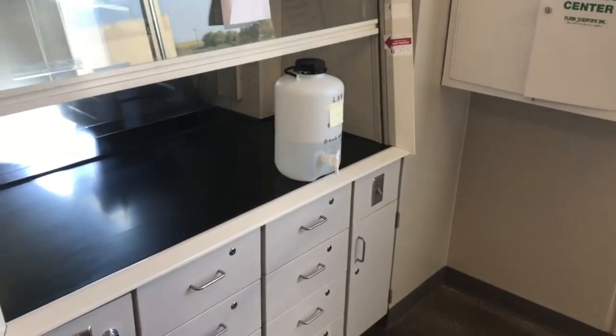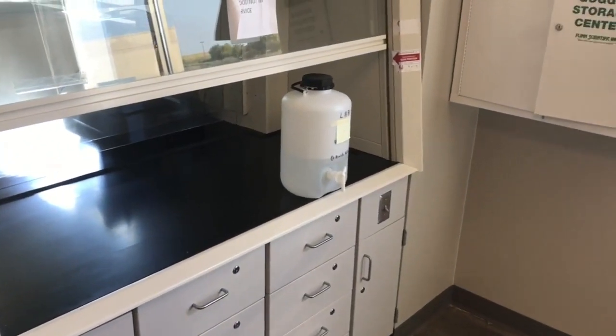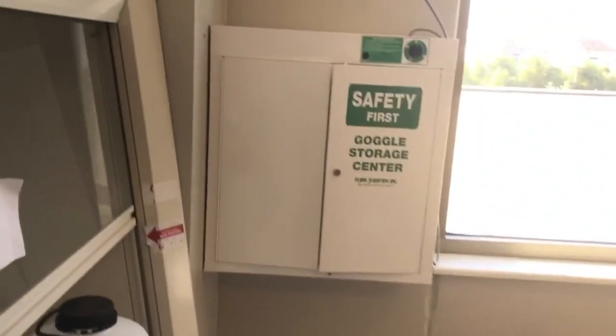Before we grab our acid over here in the fume hood, we need to make sure that we're all wearing goggles. So everyone in your group needs to wear goggles. Even if you're not the one handling the acid, I want every single person to be wearing goggles. You can find these in the back storage case over here. Everyone needs to wear goggles.